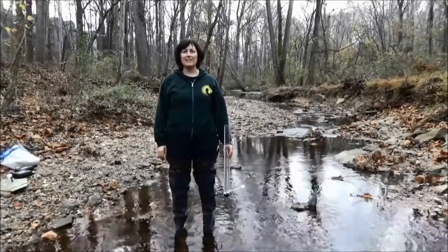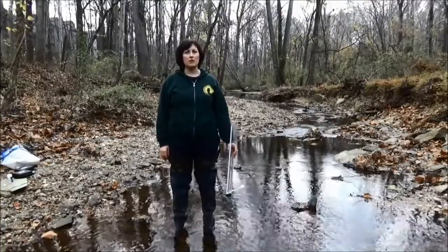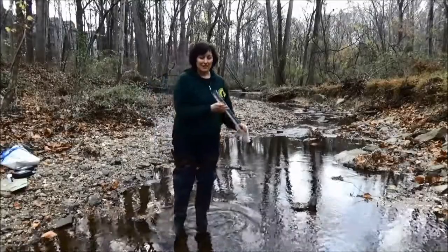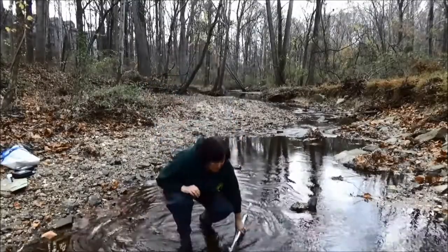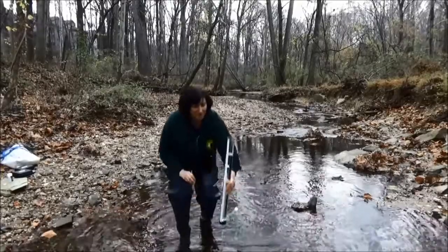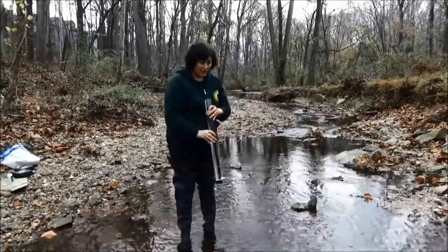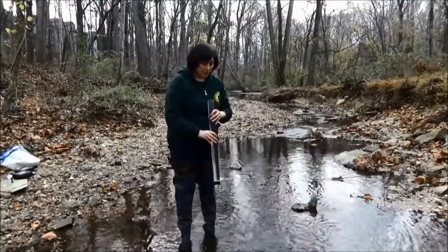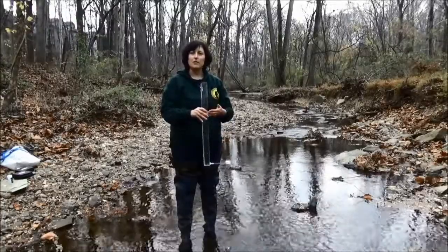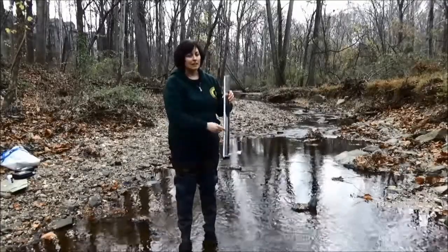It's important to test the water clarity, as this shows us how much sediment is in the water. Too much sediment in your stream can smother your macroinvertebrates and fish eggs and can clog fish gills. We're going to test the water clarity by filling up this tube, then slowly releasing the water while looking down inside. Inside the tube there is a black and white disc, and what you want to do is lower the level of the water until you can clearly see the difference between the black and the white. Then we measure how many centimeters that is, which tells us the water clarity.